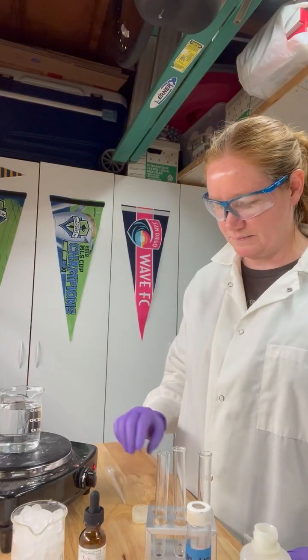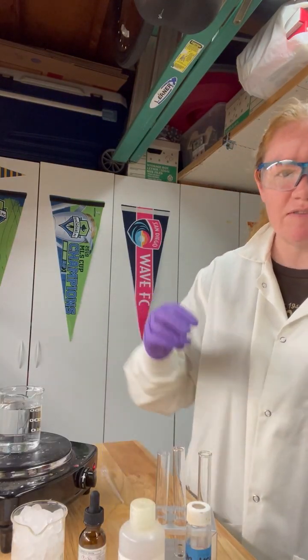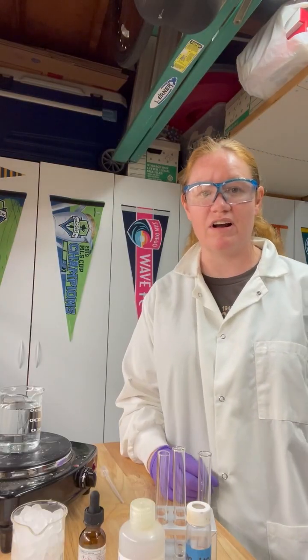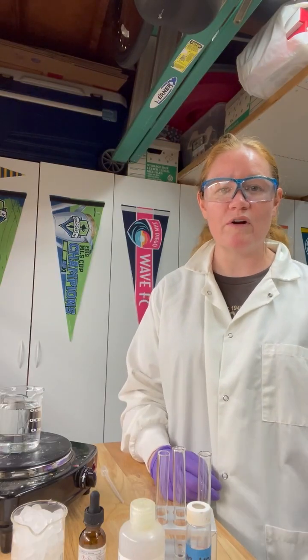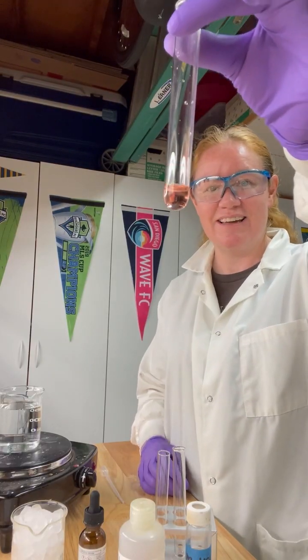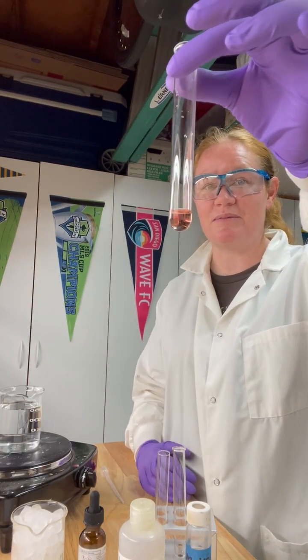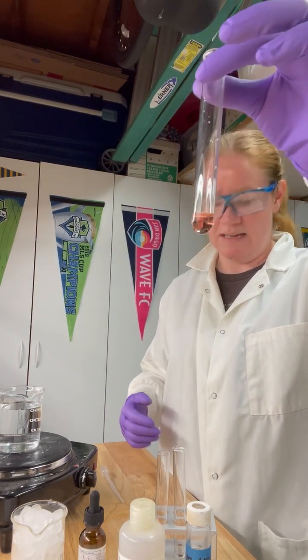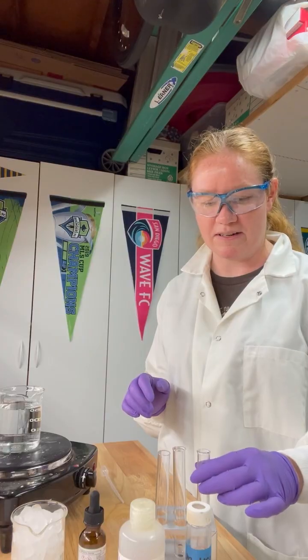All right. Now, we want to try and shift that equilibrium over to the product side. In order to do that, we're going to attempt to flood the reactant side. Because right now, if you look at this, it's pink, and one of our reactants is pink. So our initial established equilibrium is favoring the reactant side. So let's see if we can do something to force this over to the product side.